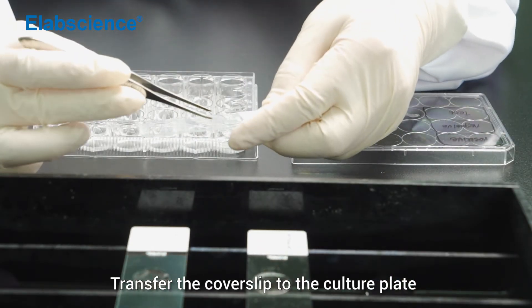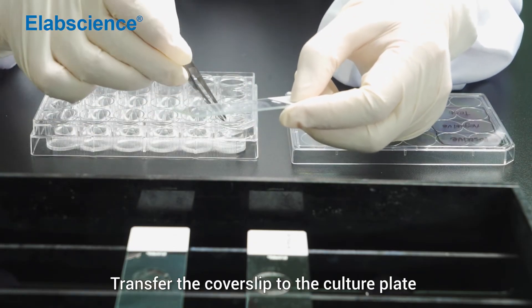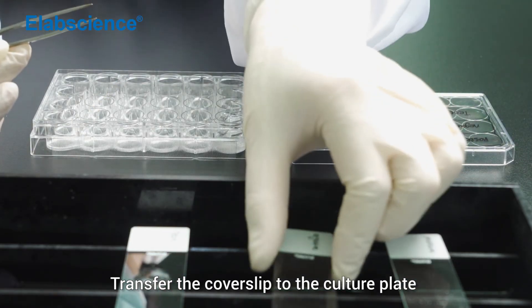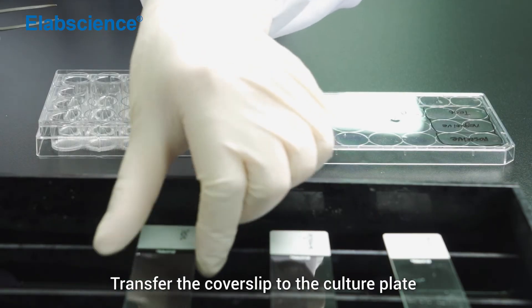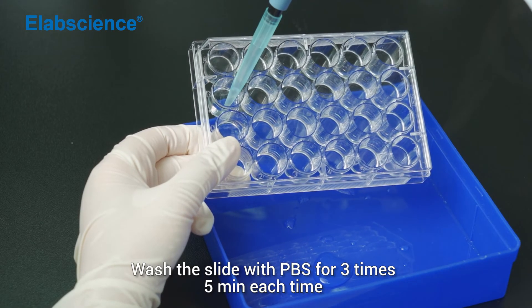Transfer the cover slip to the culture plate. Wash the slide with PBS for 3 times, 5 minutes each time.